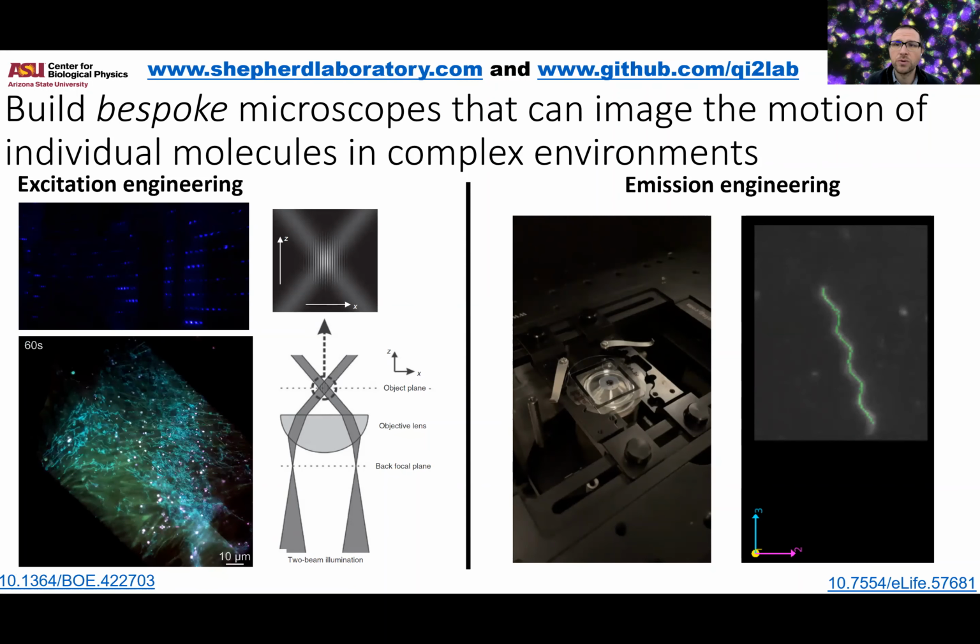This is so-called super resolution microscopy. This particular method is known as structured illumination microscopy. This allows us to build high spatial temporal resolution movies of molecular biology in action. And so in this case here, we have a cell, and inside the cell, we've labeled the lysosomes, the mitochondria, and the cytoskeleton. So these are three key components of cellular regulation.